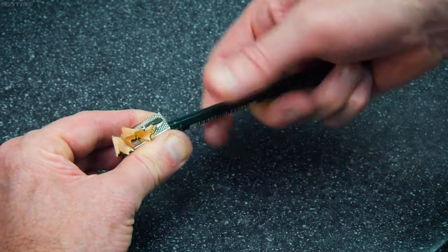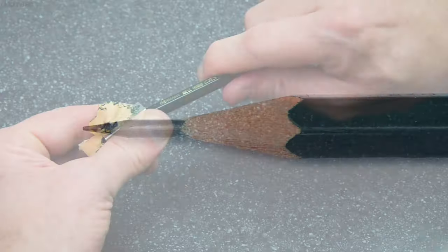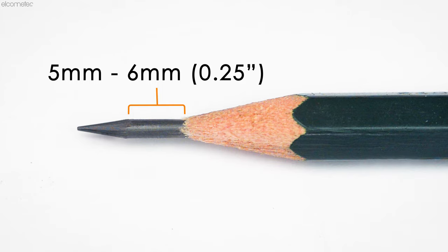Regardless of which test method you're following, to begin, prepare the pencil by using the special sharpener provided to remove around 5 to 6mm of wood from the pencil, not including the point, taking care to leave the exposed lead unmarked.